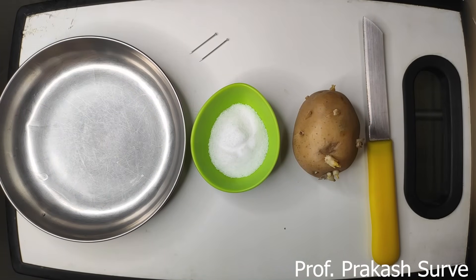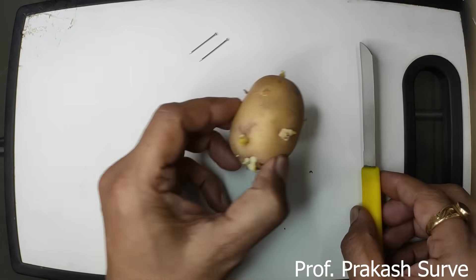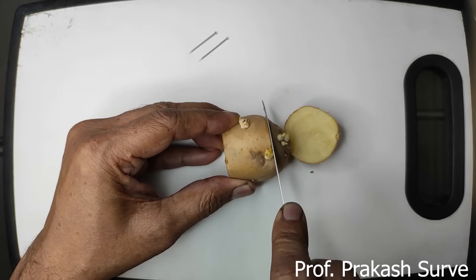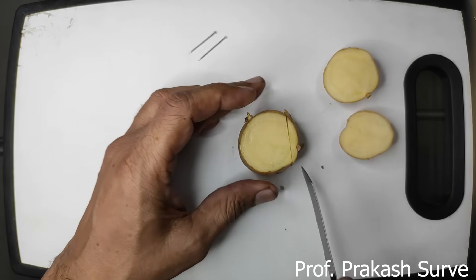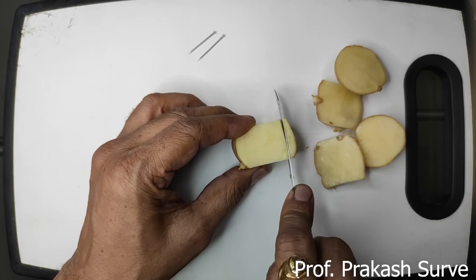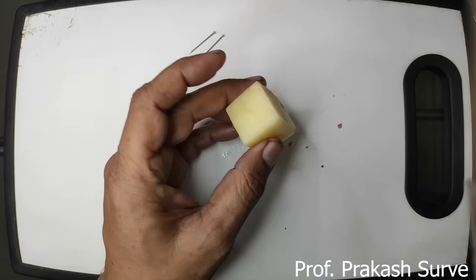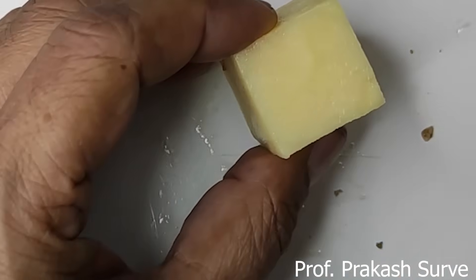First, take a medium-size potato. We simply have to make a cube shape. Cut from one side to make one corner flat, then make the other side flat as well to get a flat base. Then cut from one side and from the other side to directly get the cube. Now with this potato cube we can make the osmoscope. Remove the skin from the flat surface, then make the inside hollow.